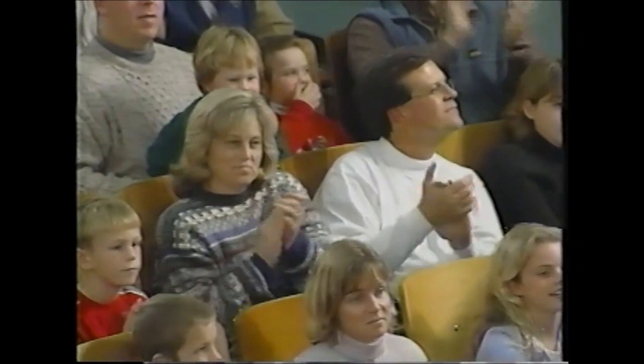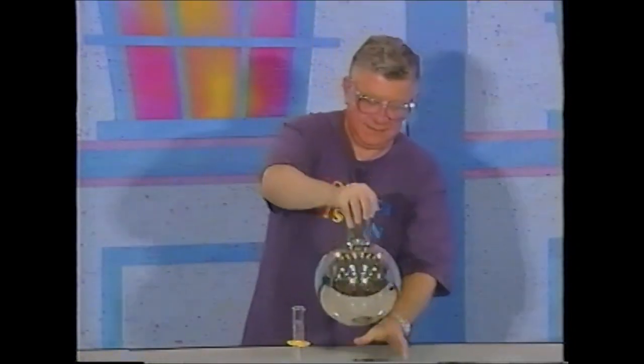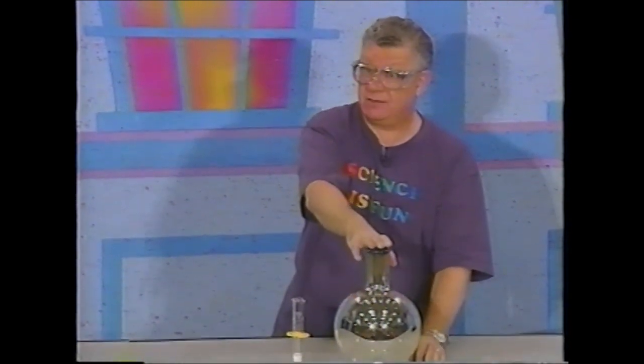Can you see anything different now about this flask than before? I can see myself in this flask right now. What we've done here is prepare a silver mirror.